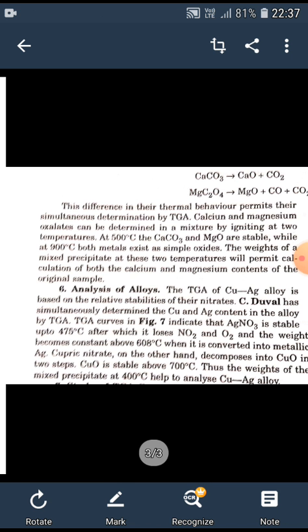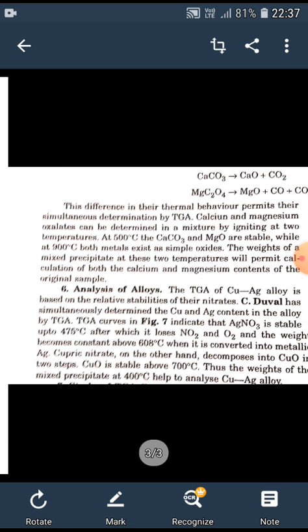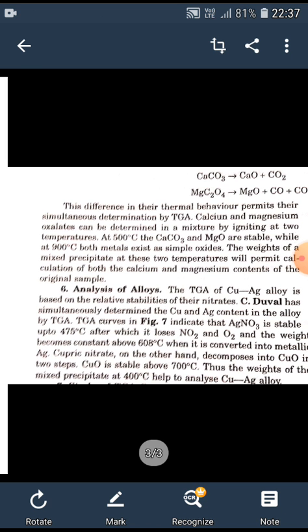In a conventional method, a cleaned sample surface is thermostated at the desired temperature in a thermobalance, and a gas at the known pressure is allowed to be adsorbed slowly. The weight gain with time is recorded. After the equilibrium gets established, the pressure is increased to the next desired level. This method is used to obtain adsorption isotherms.